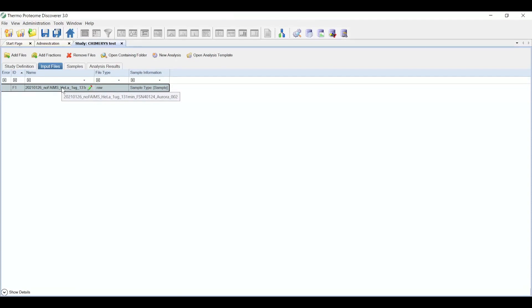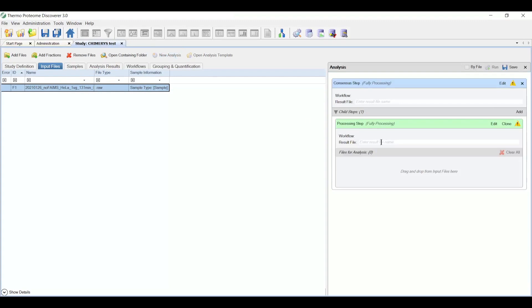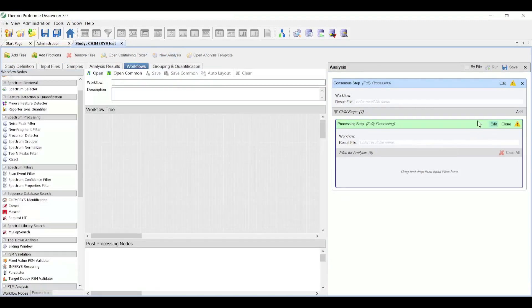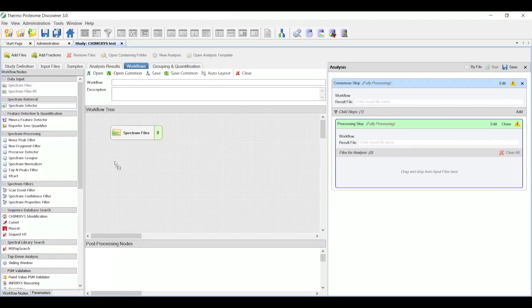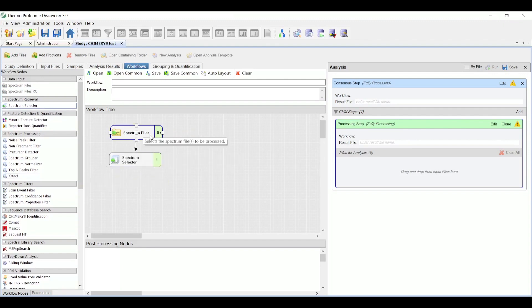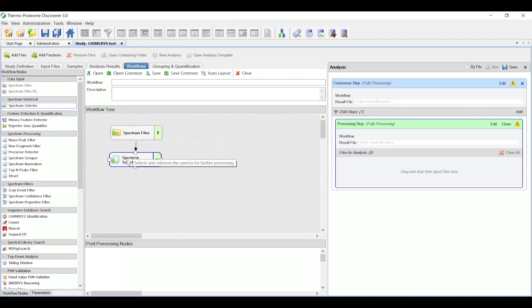The next step is to create a new analysis where we get to choose our workflows to analyze this particular data file. So for Chimera's, I'm actually going to build a workflow from scratch, but you certainly can select one from the common templates. So I'm going to drag a spectrum files node, which loads the raw data, spectrum selector node, which pulls the MSMS spectra out from the file.